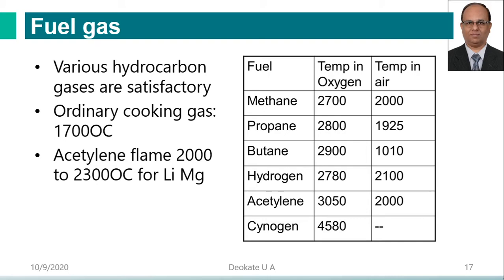So second example, you may have written the flame which is used in the welding. You have seen the gas welding stations. Okay, so what they are using, there is a small cylinder which is lying there, and one vertical column is there. So that column, they utilize certain stone like material. Okay, what is that stone like material? Okay, so just you check it what it is.